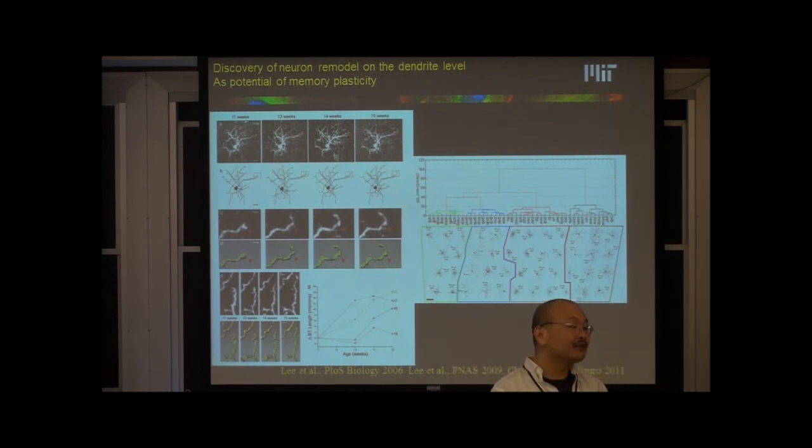Second harmonic generation can be seen from muscle structures, and you can image muscle structure. And as I showed you in the skin, in the dermis, collagen also gives you a nice signal. You can see the individual cells. Specifically, you see the cytosol of the cell and the mitochondria because you are mostly seeing NADH. Of course, every cell has NADH, so you can see the cytosol of the cell. You can see the nucleus because it doesn't have very much NADH, so you have a negative contrast.